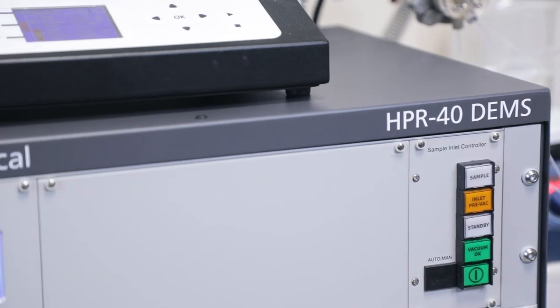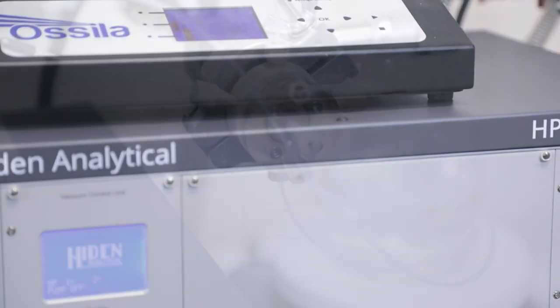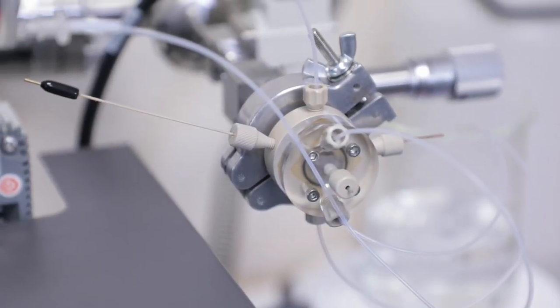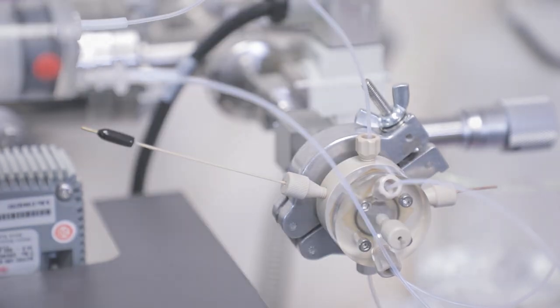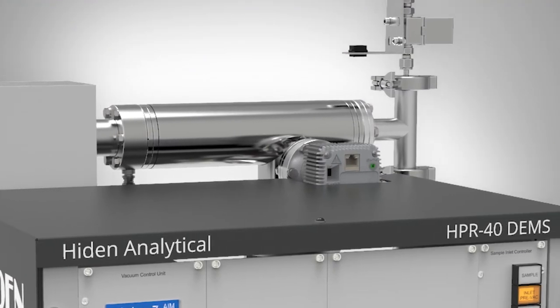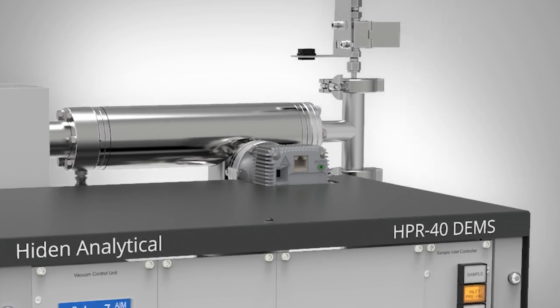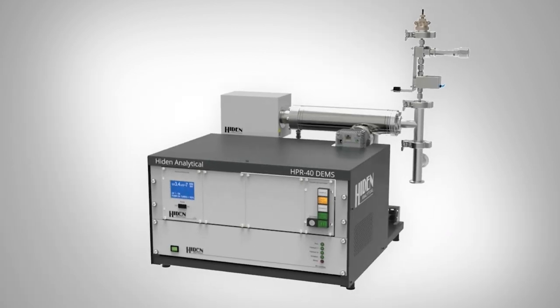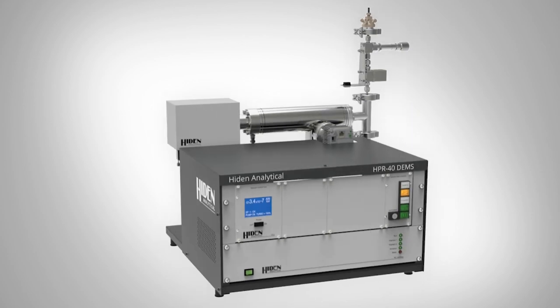DEMS is an analytical technique in which an electrochemical cell is interfaced with a mass spectrometer using a pervaporation membrane. This configuration enables volatile electrochemical reaction products to be quantified in real time, allowing key parameters such as the rate of product evolution and reaction selectivity to be determined and monitored.